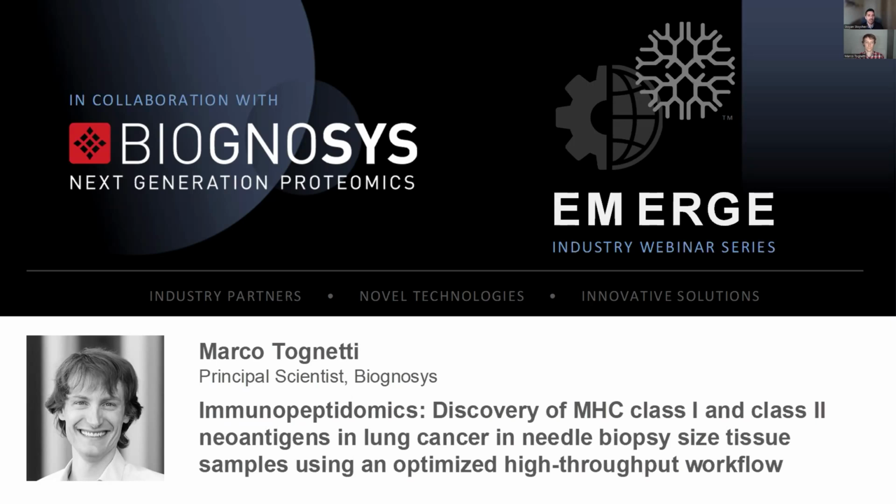And today, he'll be presenting some of the work that he and his team have put into developing and implementing a high throughput and sensitive workflow for immunopeptidome profiling from low input amounts, as well as how this workflow is being applied within the precision oncology arena.